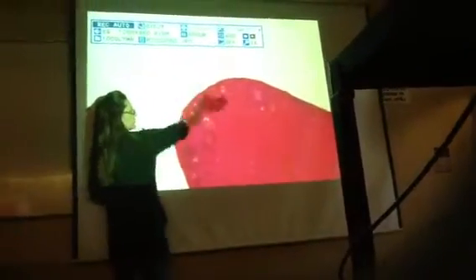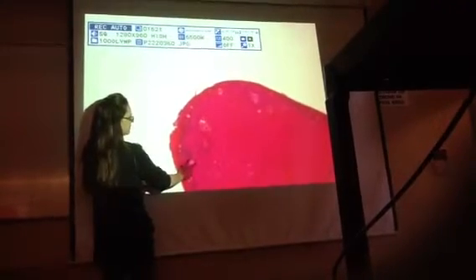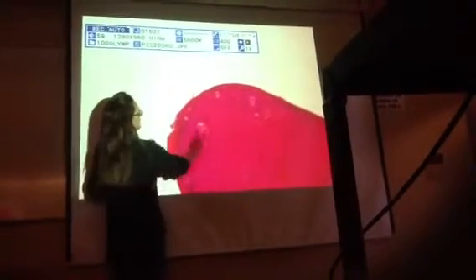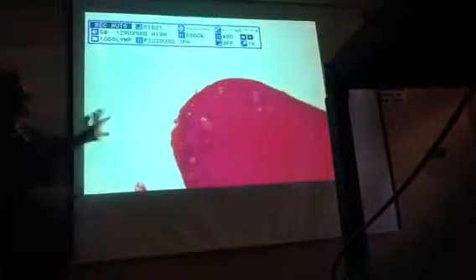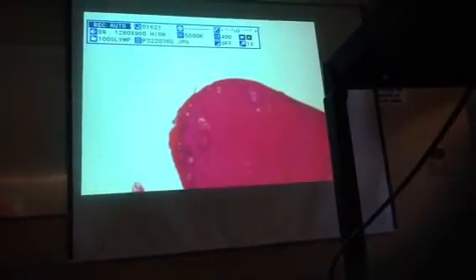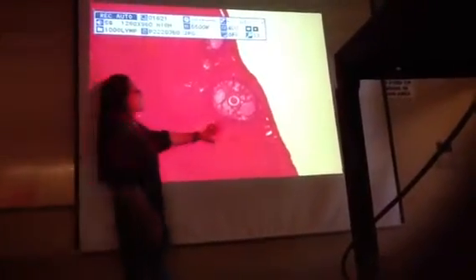You're just going to look out on the surface. That would be a follicle with an oocyte in it. This is a follicle with an oocyte in it. Here's a follicle with an oocyte in it. And again, it's a little bit hard to see being projected like this because it's so dark. But the best one that we saw was that very first one. That would be the best one. So on a test, this would be what I showed you right here because it's just so nice.